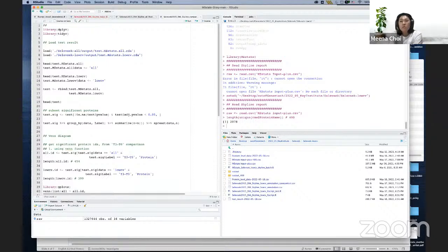They also provide some linear models, but you have to define what is best for yours, which means they have a lot of flexibility but still need statistical knowledge to make the right decision. Sometimes we have diagnostics too. MSstats does not provide multiple ways; we want to provide the best without requiring your decisions. It is hard because MSstats has only one best model, while Perseus can have multiple outputs and conclusions. So I think this comparison is not fair enough. They definitely have pros and cons, but it's really hard to compare the performance itself.